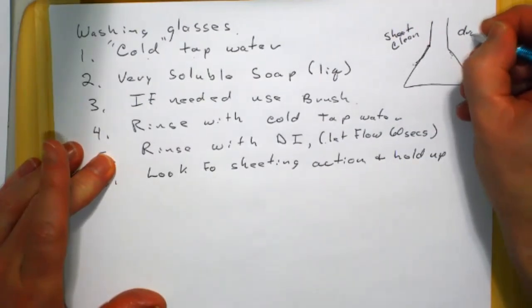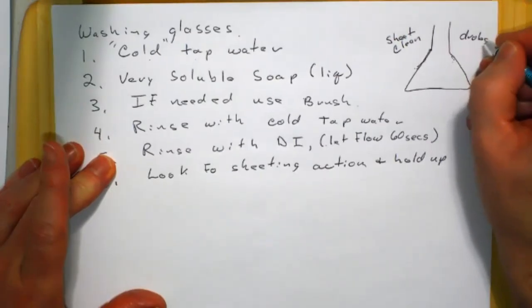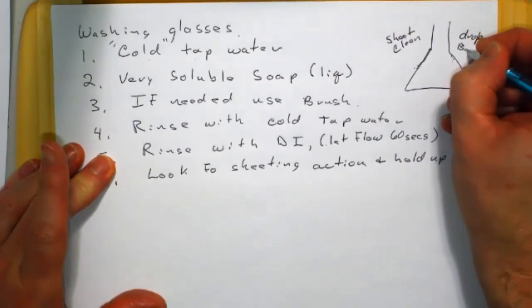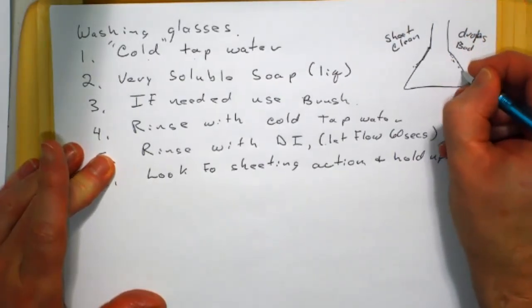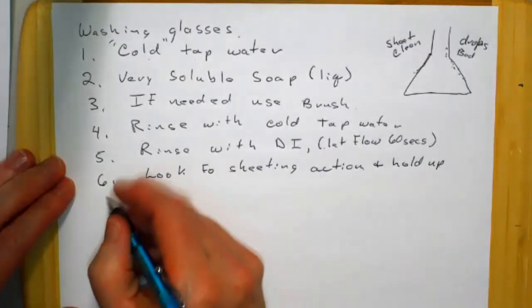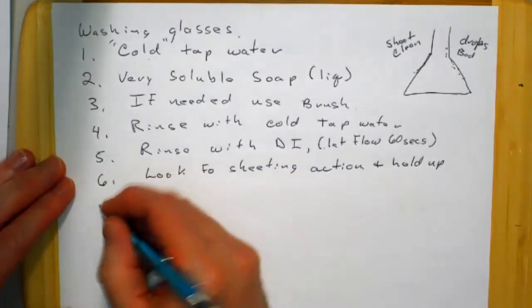Drops are bad. And my spelling's bad. So if it's covered with droplets, so look for sheeting action. If it's clean, you're done.